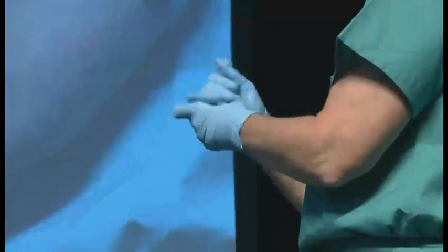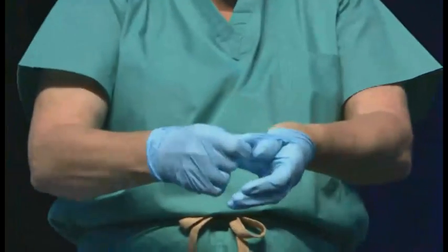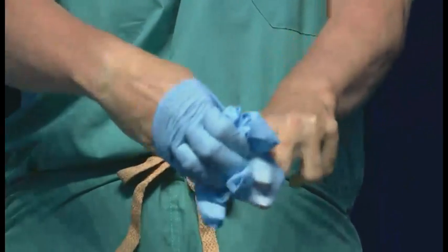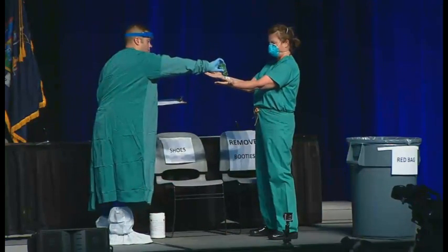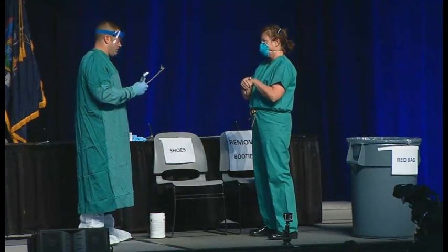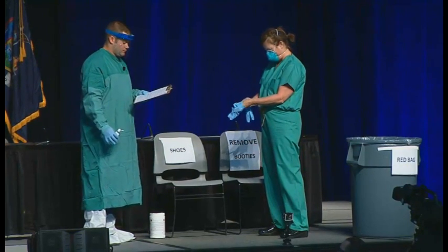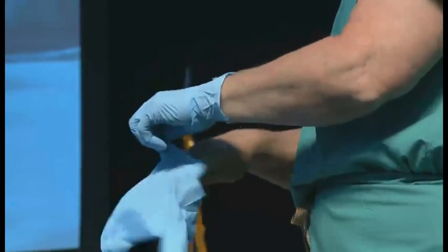Now we're actually going to remove the inner gloves. You need extra gloves in the place where you're taking off the equipment — Barbara was verifying that those gloves were there and ready. You're going to perform hand hygiene on the bare hands and ensure that your hands are dry before putting on the new clean pair of gloves. Why put on clean gloves? Because she's about to take off the mask. So we recommend you clean the hands, put on clean gloves, and then proceed to the next step.